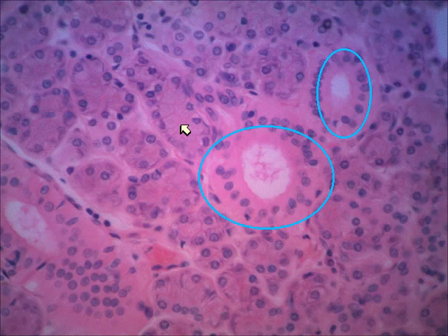In this area, with this secretory cluster, notice that the cytoplasm of the cells is fairly light in color. Those are some mucus secreting. In this one, you see a little bit darker, it's grainier looking, and that's probably some serous secreting cells.